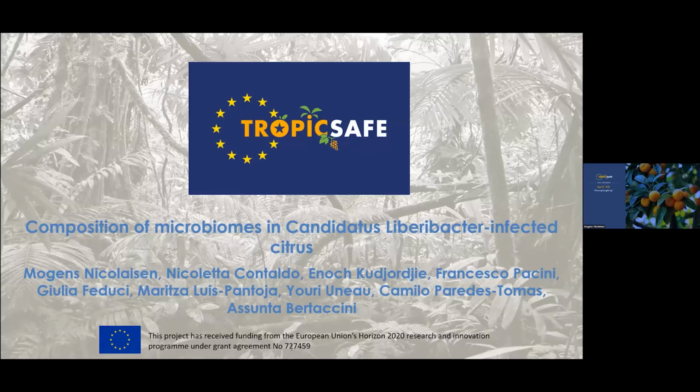Afternoon, everyone. I'm sorry that I couldn't go to Corsica, but I'll present our work on microbiomes and the development of next generation sequencing methods for analyzing microbiomes in the hosts that have been dealt with in Tropicsafe, that is palm, grapevine, and citrus. Today, of course, I'll focus on our work on citrus.